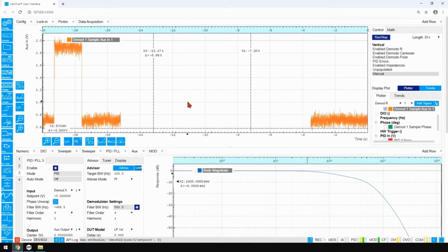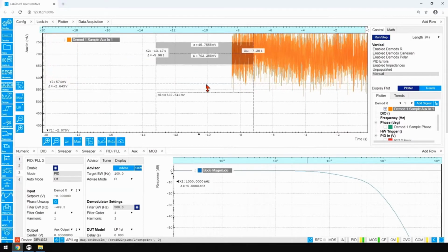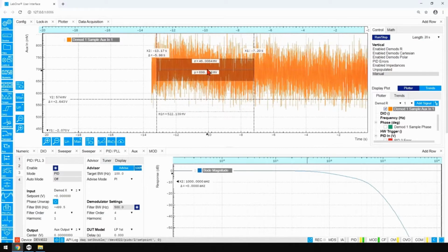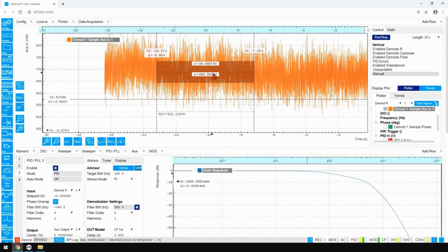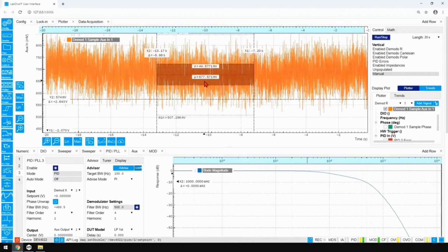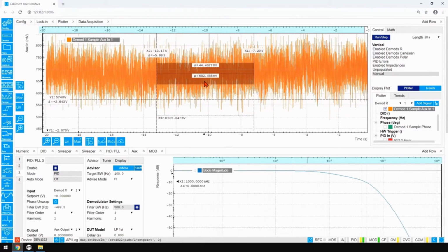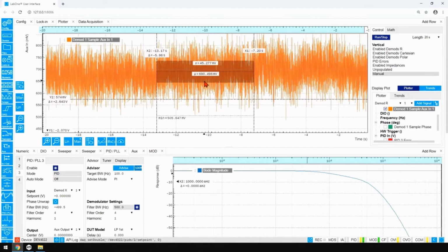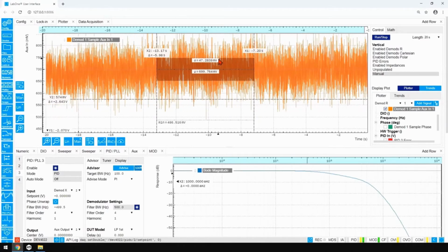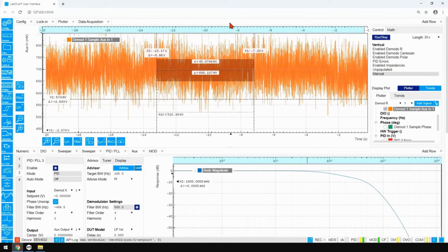And then I can also look at the signal to noise ratio. This signal to noise ratio is going to be, of course, a little bit higher because of what I mentioned just before. And this is what we observe here. We, by the way, don't have the same CPD. Well, we are in a different location, but also because the two different ways of measuring have a slightly different contribution to the overall force. So that gives us a certain offset. And the standard deviation is also bigger, almost 3 times, which is the difference in gain sensitivity.